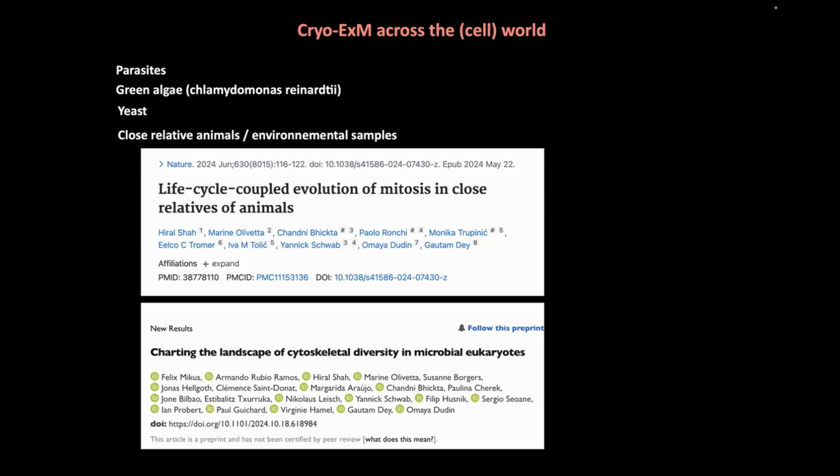So with these specific samples, it's better to use a high pressure freezing machine, for which you need an EM facility, of course. So I didn't put a lot of information about this because I wanted to present something that you could do directly in your lab if you don't have an EM facility nearby.